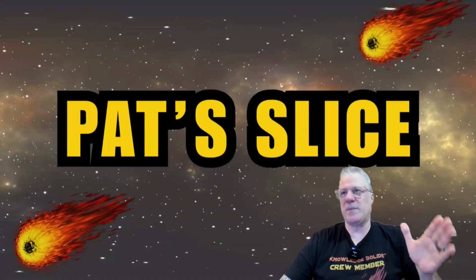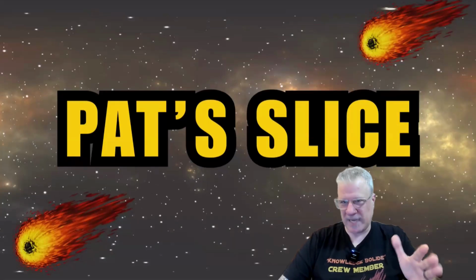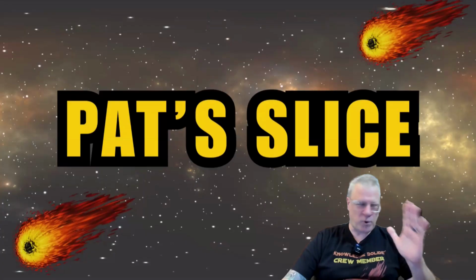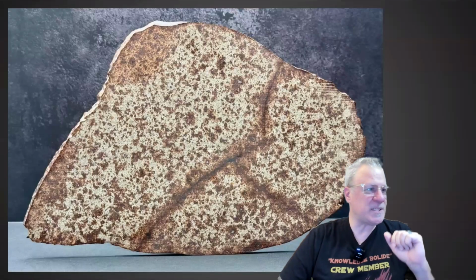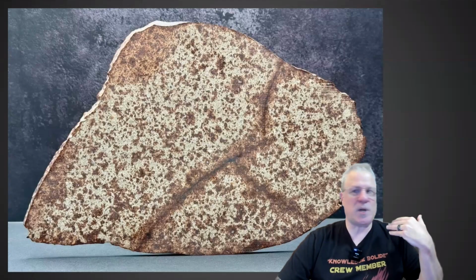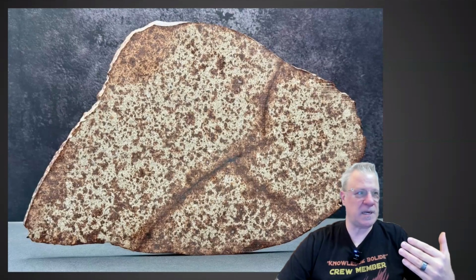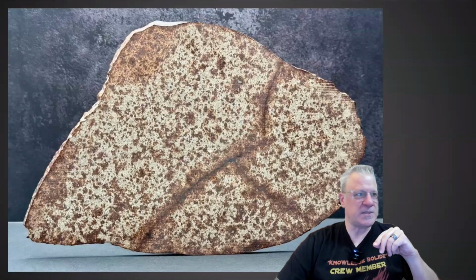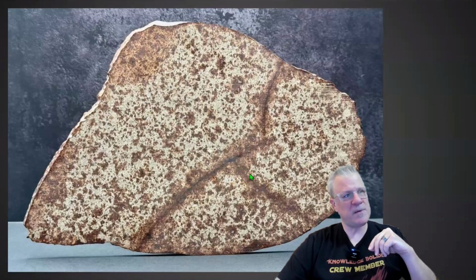And then I'm going to turn it over to Daniel, I promise. This is Pat's slice, the unpolished side, and I just wanted to point out some things that we're going to be talking about throughout this conversation. These shock lines, these shock veins, go through every single slice in the exact same formation.